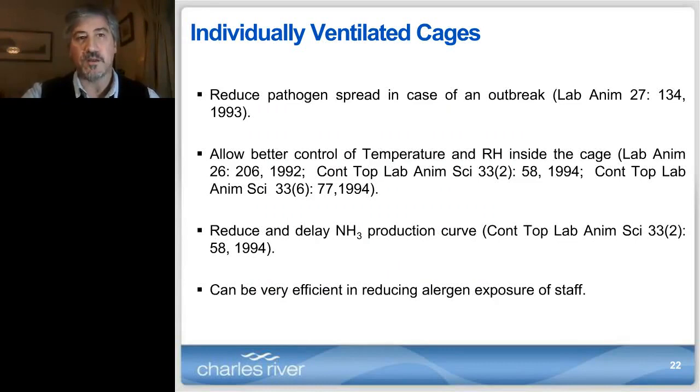Let me continue with the microenvironment and make a comment, because especially for rodents, it is very, very common to use individually ventilated cages, right? So this is an additional factor that will influence the microenvironment of the animal.